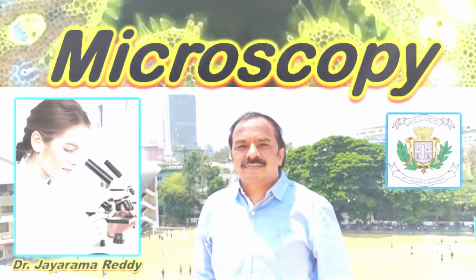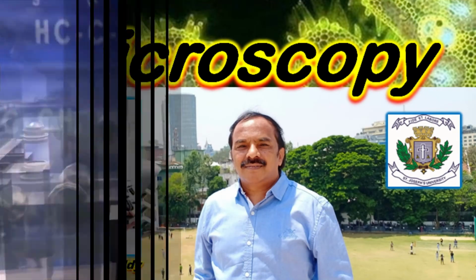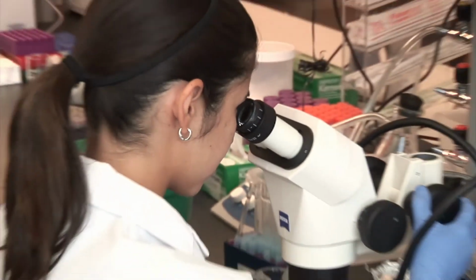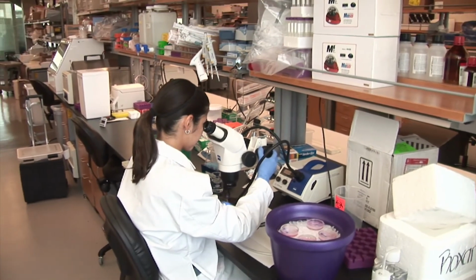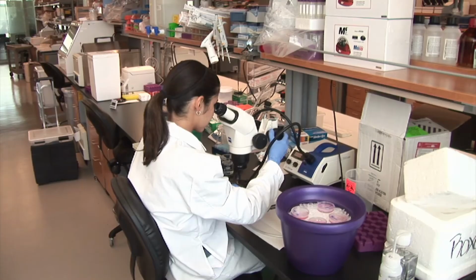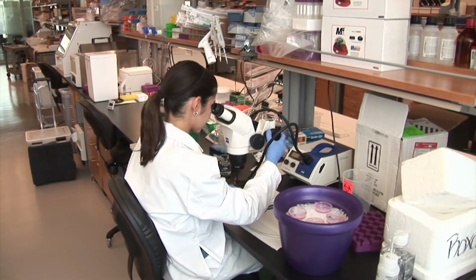Welcome to a new video on microscopy. The invention of the microscope opened up the microscopic world. It caused a sort of revolution in the scientific world. Zacharias Janssen made one of the earliest compound microscopes in 1600.